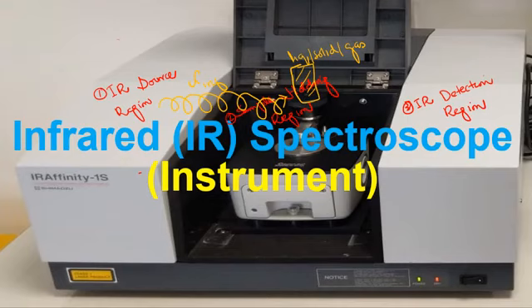Infrared radiation interacts with the bonds of the chemical and causes a vibration in the chemical bond, and due to this a specific wavelength of infrared radiation is absorbed by the sample, whereas the rest of the IR radiation moves on and is detected by a detector in the form of transmitted radiation.